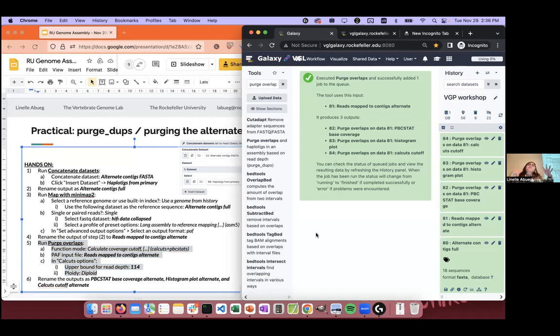And so with more coverage, you have more of the peak separated. Yeah, because with more coverage, the further away the haploid peak is from that error bit all the way at the beginning of the histogram. It's nice to have the low read depth stuff because it helps you determine what's junk and what's happening.